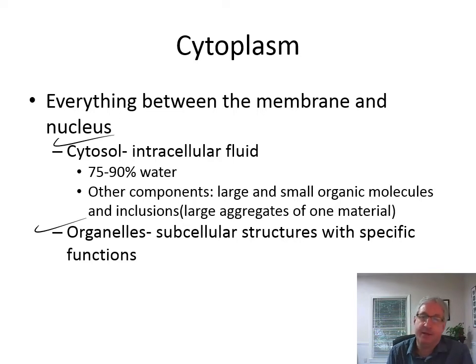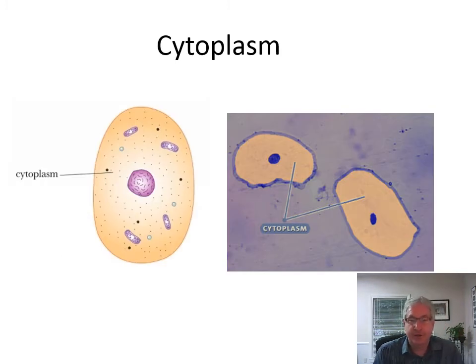Okay, anyway, next slide. So just to show you what the cytoplasm is, the cytoplasm is between here and there. So that's the cytoplasm.